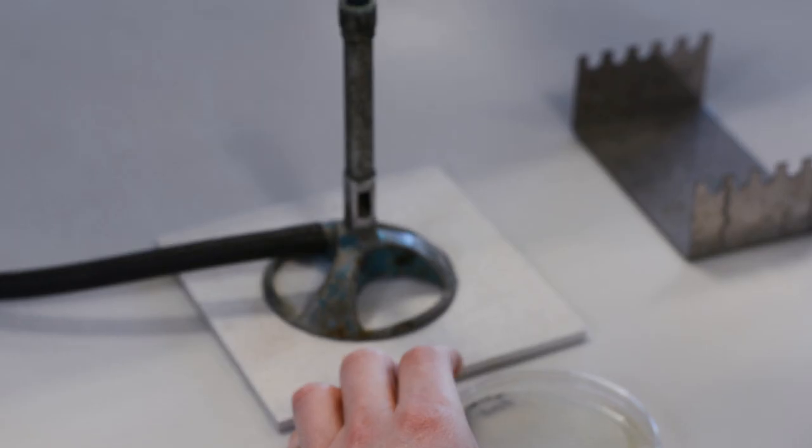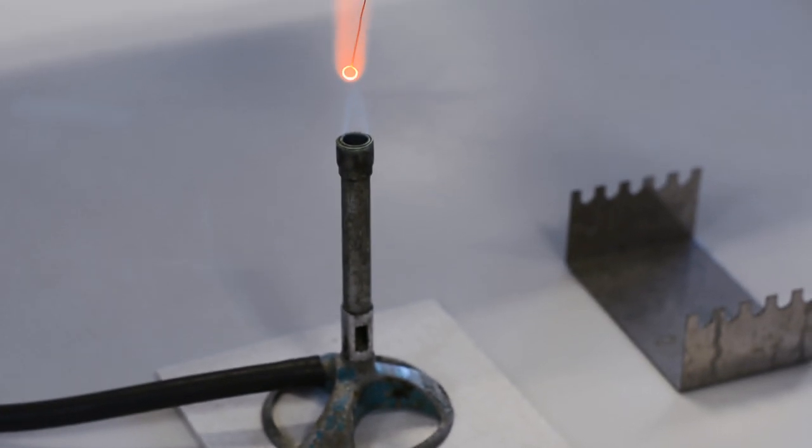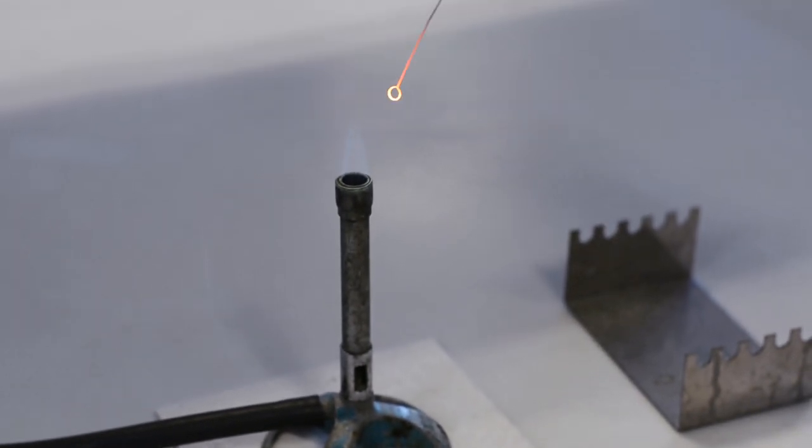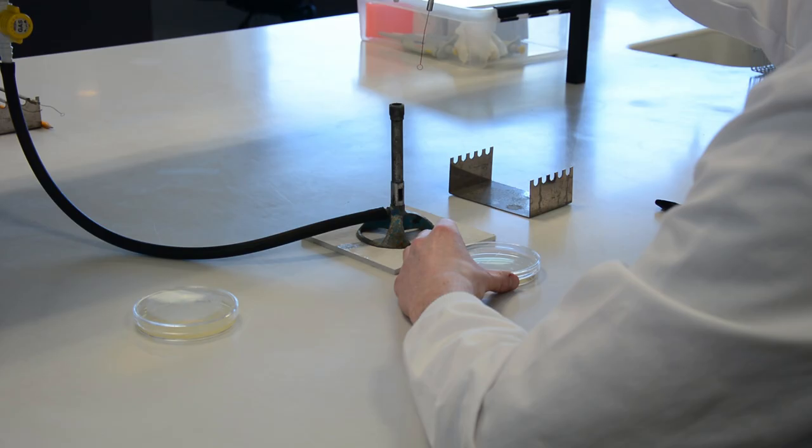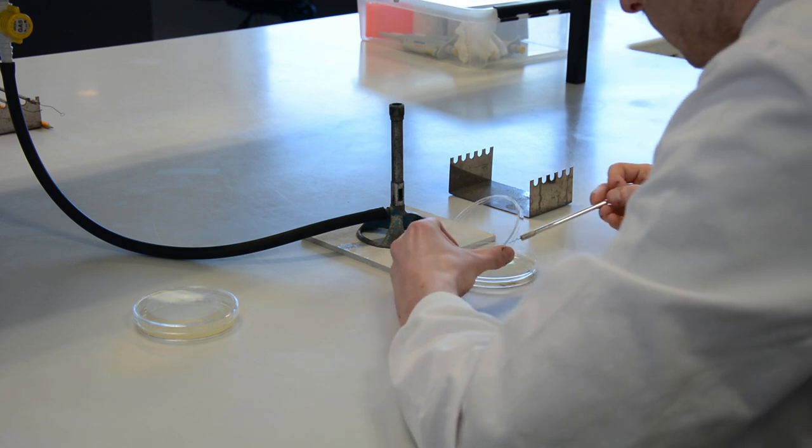The loop is sterilized again and used to move a further amount of culture across the plate, as shown in part 3 of the drawing. During this, care is taken not to overlap the original inoculum.